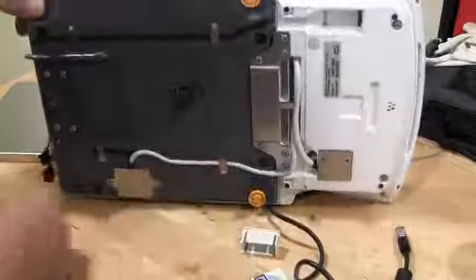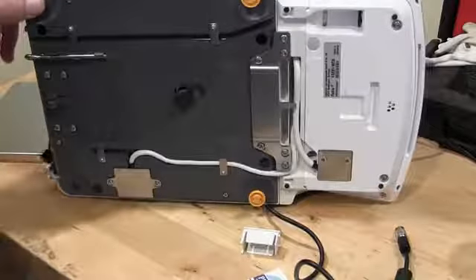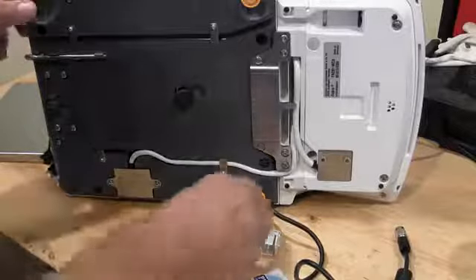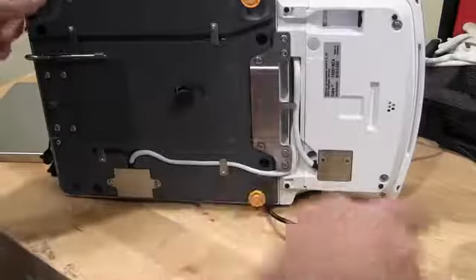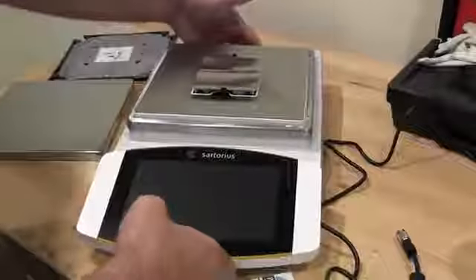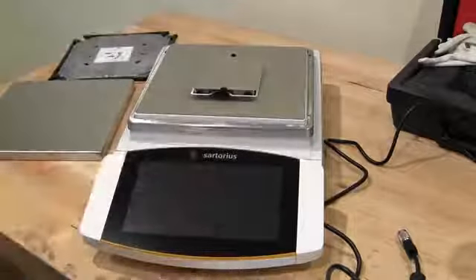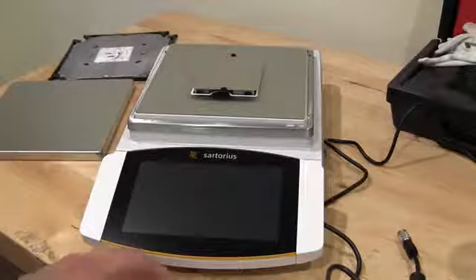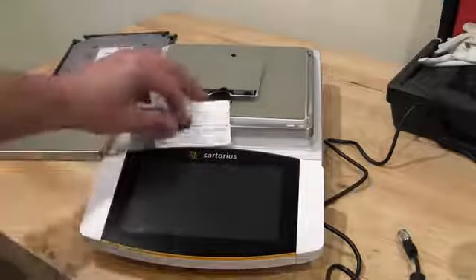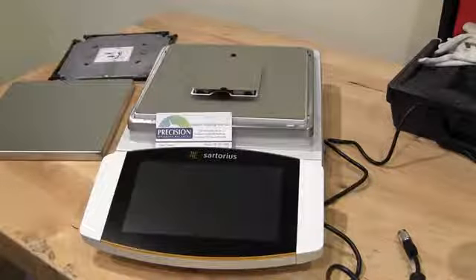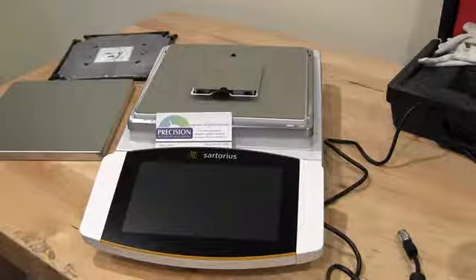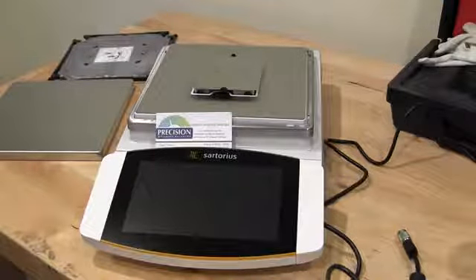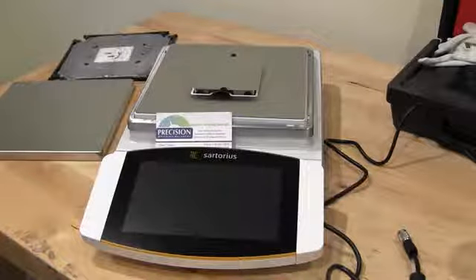So that's a general overview of the new Sartorius Cubis 2. This is a high-end balance that's definitely marketed for the pharma industry. If you have any questions, give us a call or visit our site at scaleman.com. Thank you.